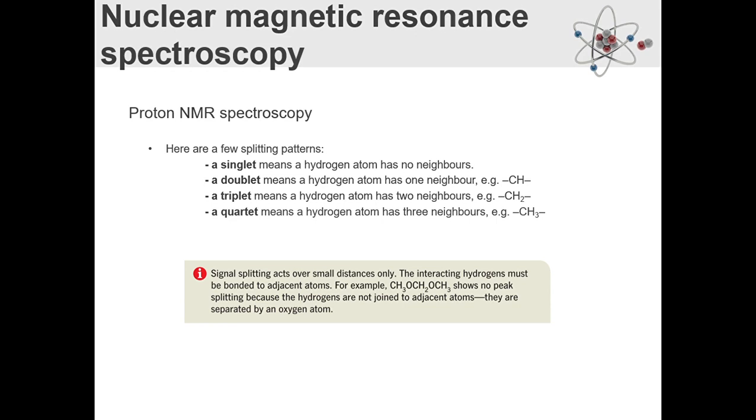Now, here's what I'm going to tell you. You're not going to find it in a textbook anywhere, because this is not actually explained until about 3rd year uni. So I'm going to explain it to you now. It's called 3J coupling. If you try and say 3J coupling in an exam, nobody's going to give you any marks because you're not supposed to know it. But if you are trying to see whether a hydrogen atom can see a different hydrogen, what you need to do is count the steps or the bonds.